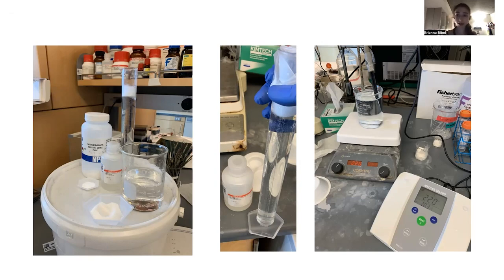I stripped my membrane, did some washes, and reblocked it, and now it is going overnight with the second thing that I want to test for.